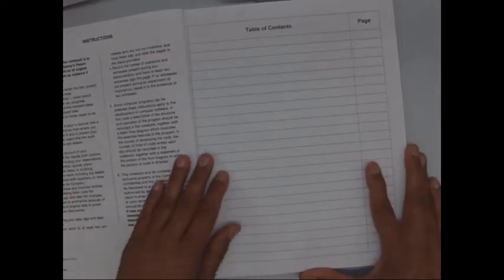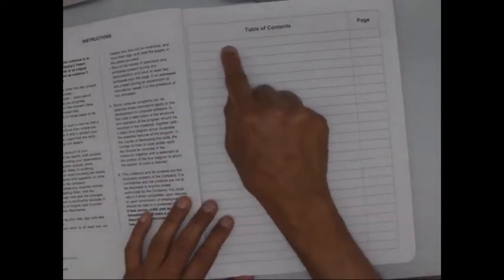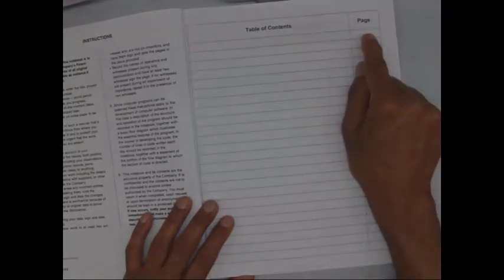The next page is the table of contents. Every time you start a new lab or a project or any kind of discussion which you are recording in the lab notebook, you should write the title of that particular process and write the page number on which it has started. Now there will be multiple pages of contents because there are a number of activities you will be doing and a number of discussions and projects you will be having.